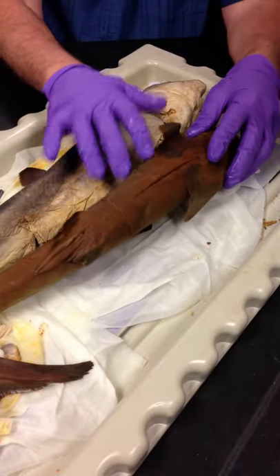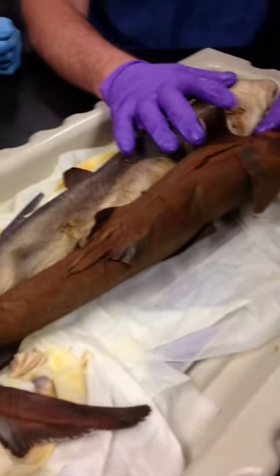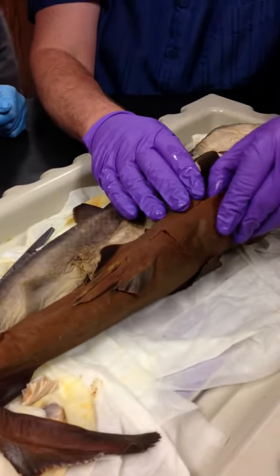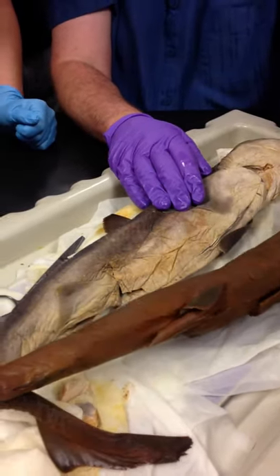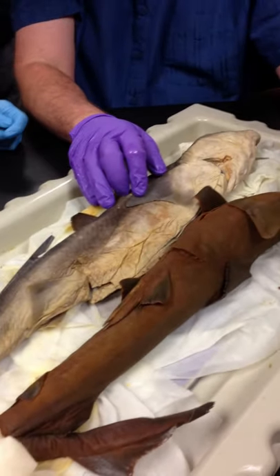Now, how do I know? I read the bag. The male one was not preserved properly. This is brown, and if you listen to the crack, he was not good. So we're just going to do external anatomy with the male, but that's all right, because that's really all that works anyway. It's external anatomy.